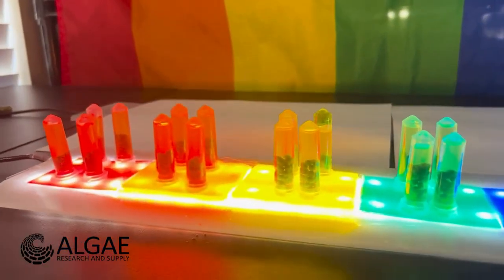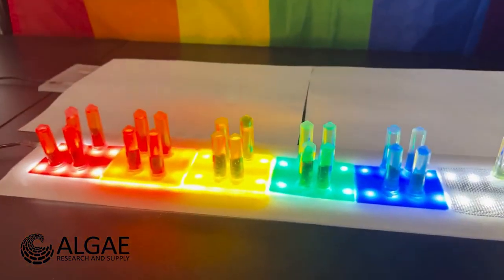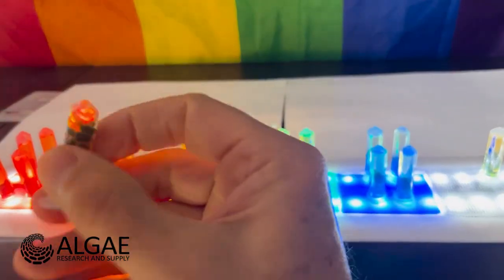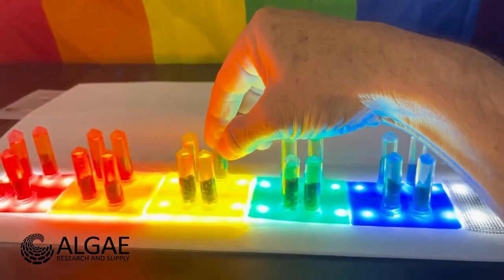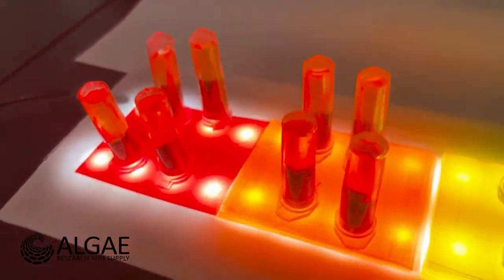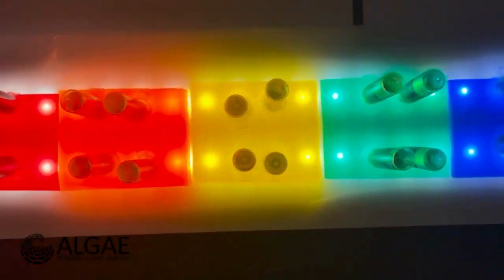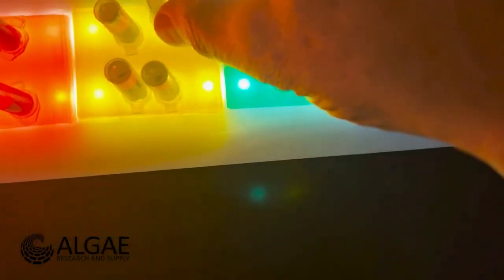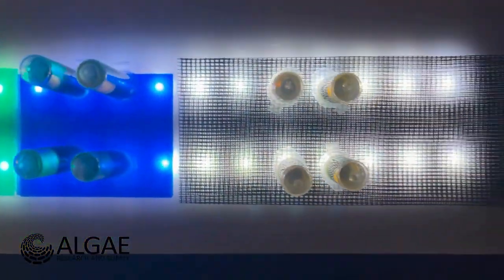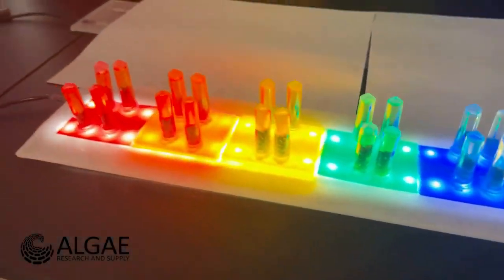Okay, so now we are getting ready to do the experiment. We have all of our colored filters there. We want to make sure that we don't have the algae beads stuck on the top. So shake those down so they're coming in contact with the light, or the exposure of the light. And we want to make sure that they are right over the LED so that we don't have anybody that is getting less light. And from there, we'll check back in every 15 minutes until we see some color change.